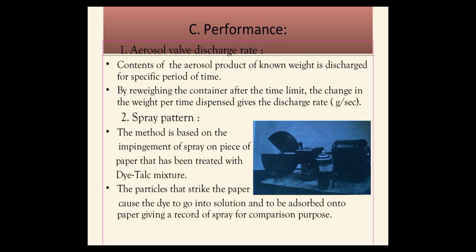Performance: aerosol valve discharge rate, that is, how much amount is discharged. A content of aerosol product of known weight is discharged for a specific period of time, and the container is reweighed after the time limit. The change in weight per unit time gives the discharge rate, and that we have to measure in grams per second.